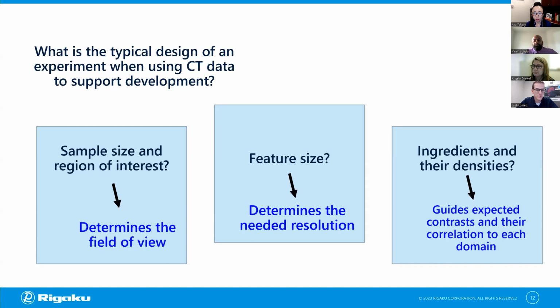And with that, I'll stop and see if there are any questions on the experiment design for CT scans. Let's take a look. Is there a guideline in defining a field of view to make sure that you have a sound representation of your sample?